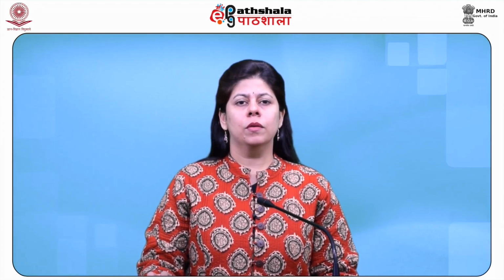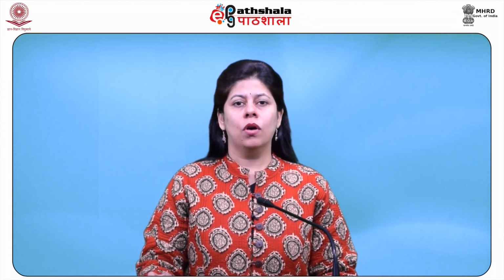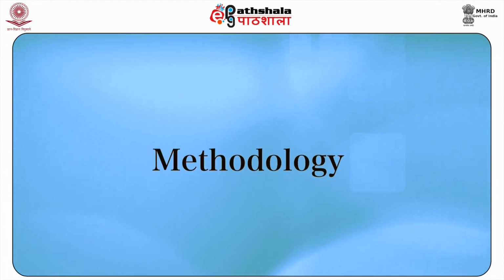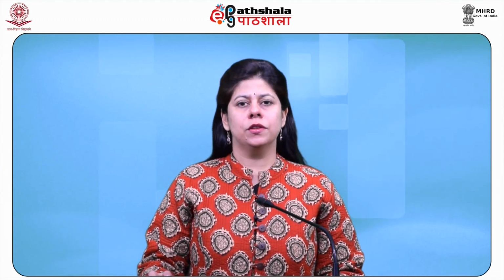The value for a molecular sedimentation velocity in a centrifugal field is called its Svedberg constant or S. You can see the calculation of S expression given here, where M is the molecular weight, S is the Svedberg coefficient, V bar is the partial specific volume of the molecule, N is Avogadro's number, and F is the frictional coefficient.